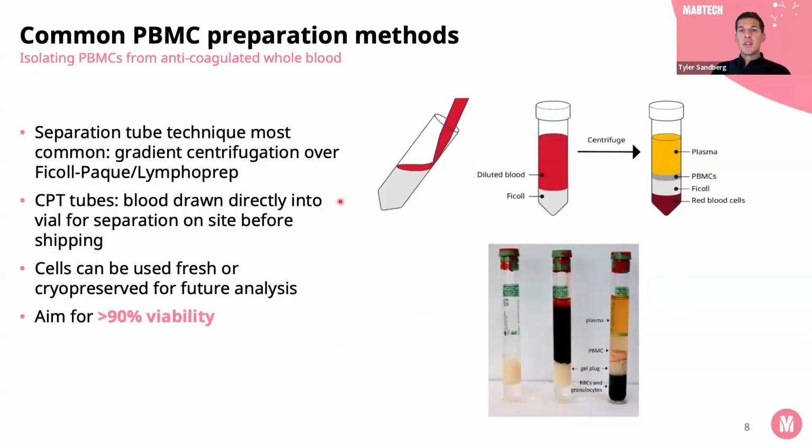But regardless of which method you're using, you might need to tweak things here and there to get that 90% viability. We show exactly how we do things on our website. We have a nice YouTube video showing how we do PBMC isolation, as well as a step-by-step protocol online.